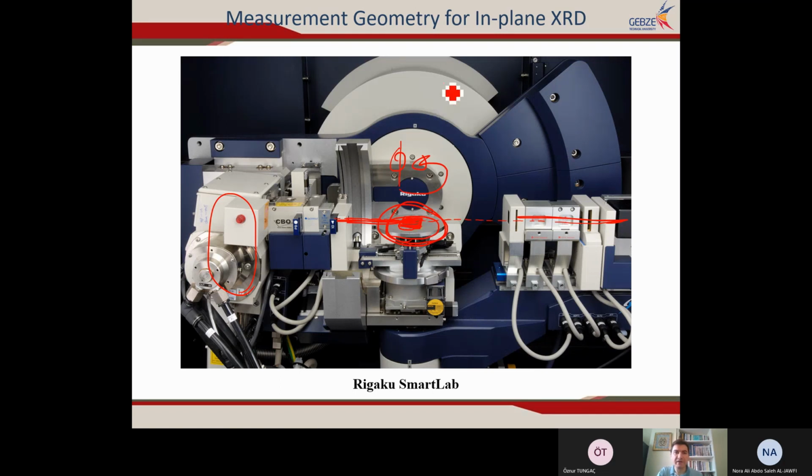So let's consider here you have a cubic unit cell, and you have these planes. If you rotate this around itself, completing phi, 360 degrees, 180 degrees, and 90 degrees, what do you see? You will see diffraction peaks related to each plane, like this: 1, 2, 3, 4, four planes related to the surfaces of this one.